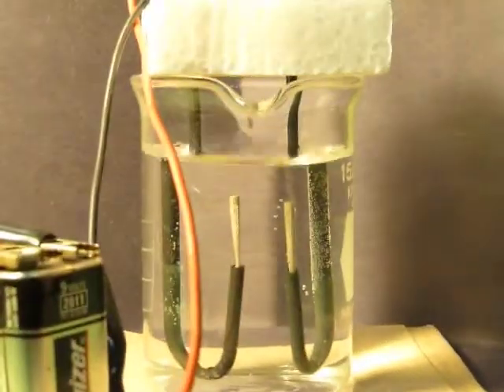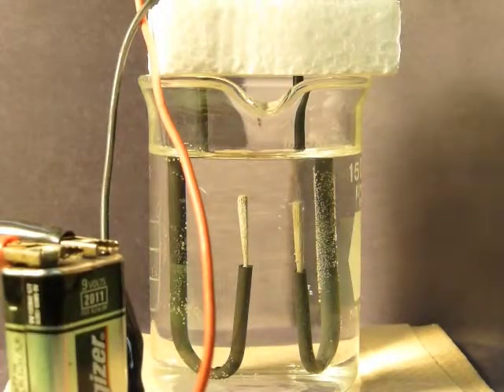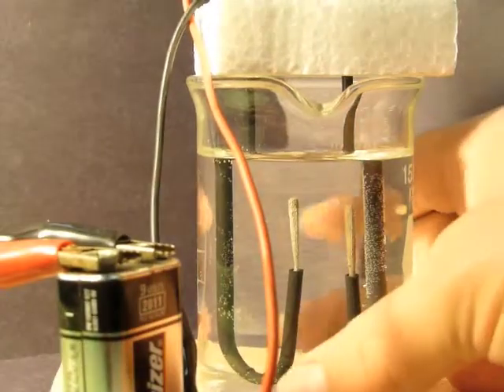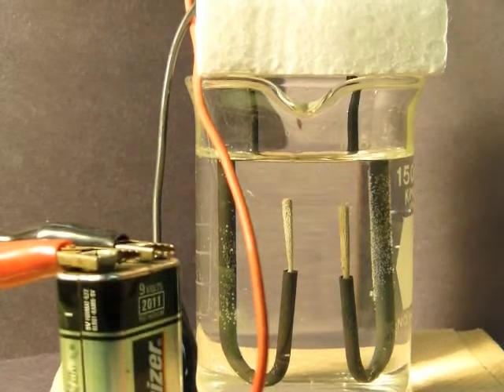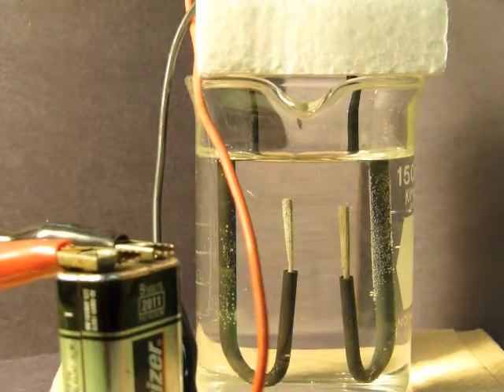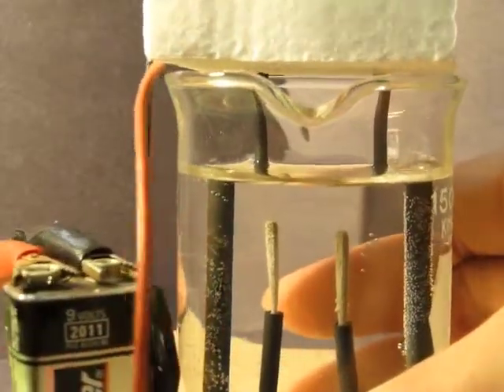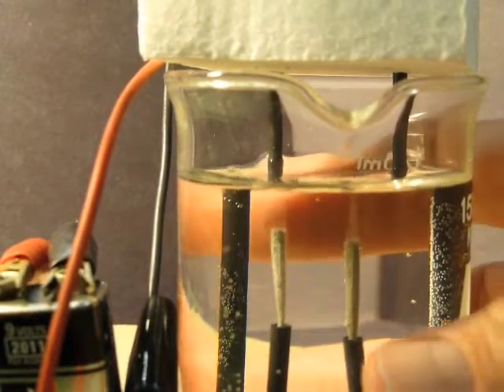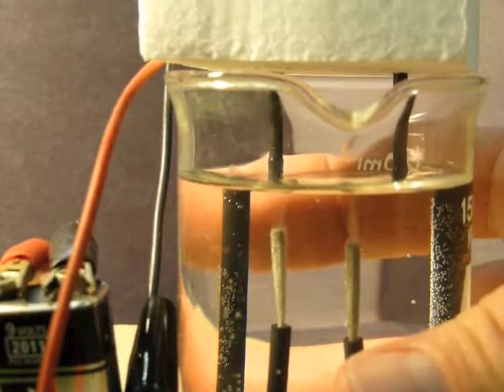Here I've got some water in a beaker, and there's a battery attached to some wires, and I'm using electricity to split the water molecules into their 2 elements. If you look really closely, you can see some little tiny bubbles there on each of those wires. I'll get a little bit closer there. There's some bubbles right there on the other side too. Those bubbles are hydrogen and oxygen gas.